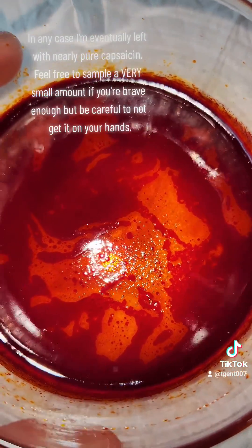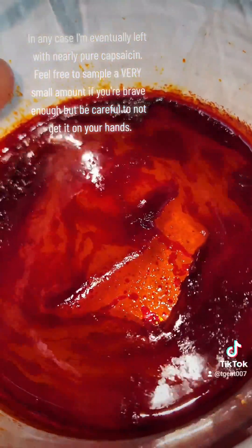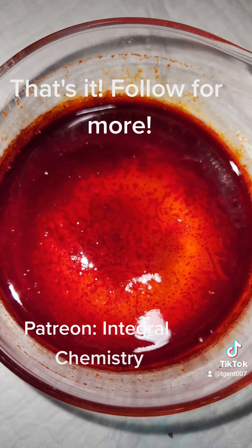I'm eventually left with nearly pure capsaicin. Feel free to sample a very small amount if you're brave enough, but be careful to not get it on your hands. That's it — follow for more.